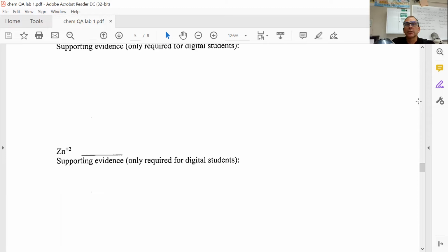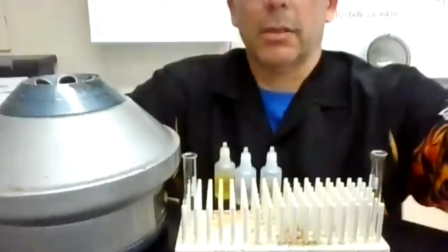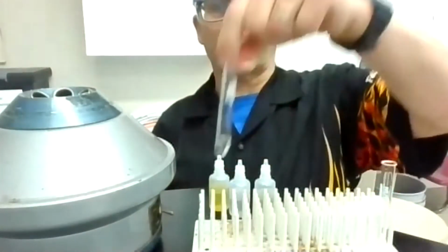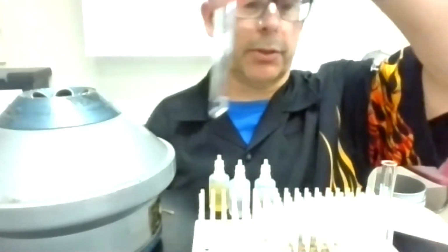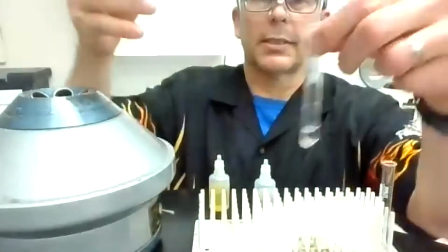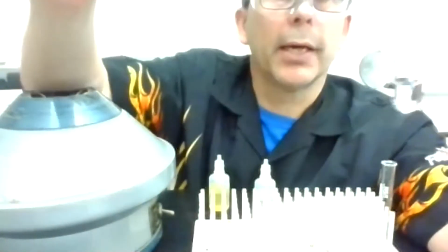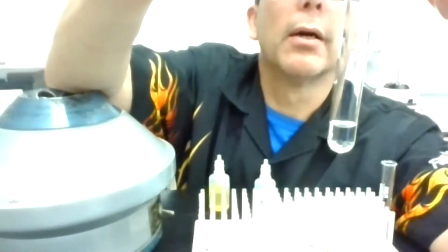All right, let's stop our share and give you a better screen to see this letter E. So I'm going to take a look here, and I'm going to fit this on here. And I have this test tube, and I think you can see it's a clear solution. I'm going to add Cl- to it. So watch what happens when I add Cl-. It'll go right here.